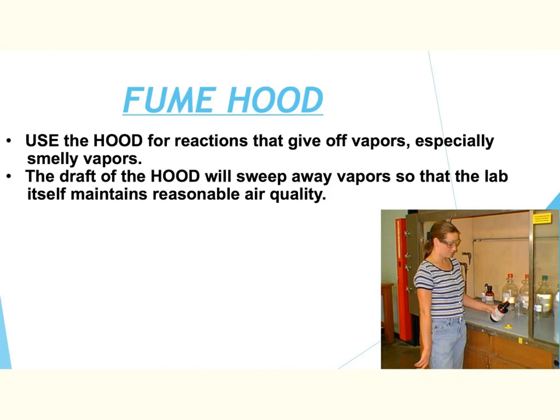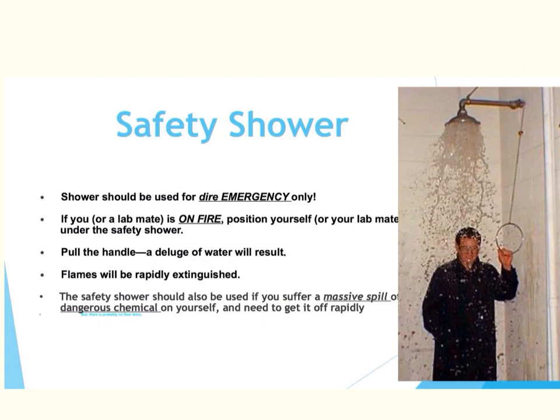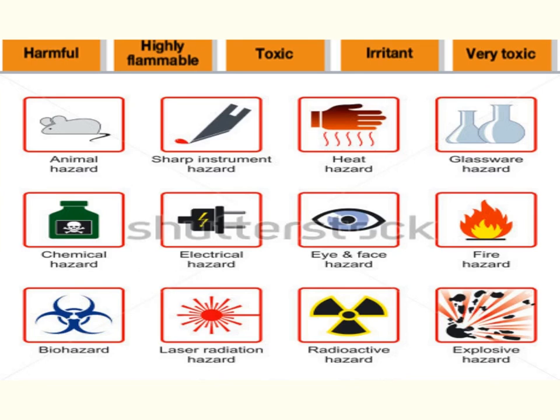The fume hood is used for reactions that give off vapors that are extremely smelly or harmful to the lungs. We have a dual-sided fume hood in our lab, which allows students to work on either side, pull the glass down, and be safe. We will be showing you how to use this in the lab. We also have a safety shower that you pull — it will douse you with water if you ever get a major chemical on your body. It is located in the far back right corner of the lab.